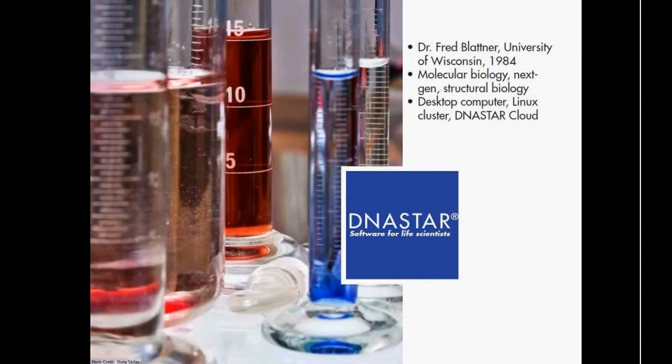Some history about us. We were born out of the E. coli lab of Dr. Fred Blattner, who was a professor of genetics at the University of Wisconsin in 1984. We built a strong reputation with our early products during the Sanger sequencing years that still continue on today. We still offer these classic sequence assembly and analysis tools. We have also expanded into the realms of next-gen sequencing, supporting all major next-gen sequencing platforms. In addition, we also now offer software to assist in the work of structural biologists.